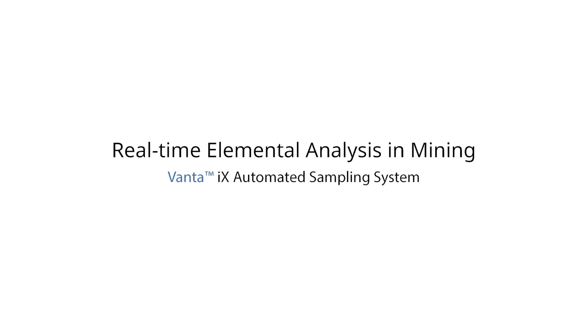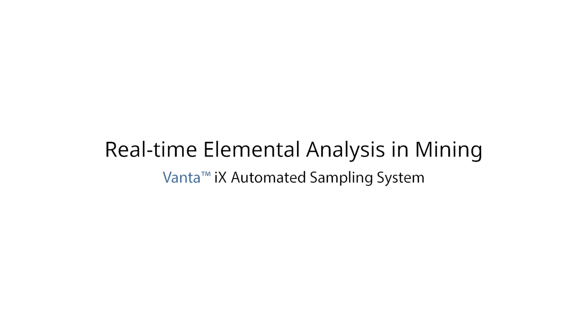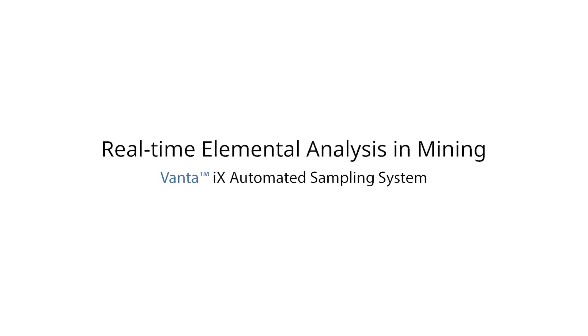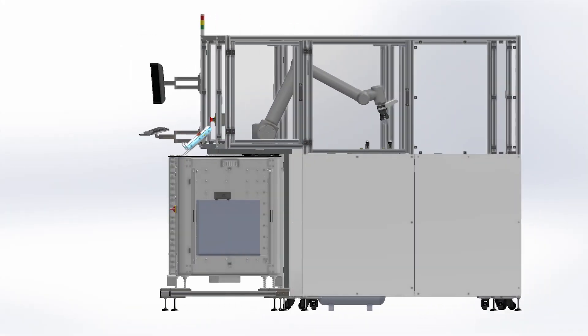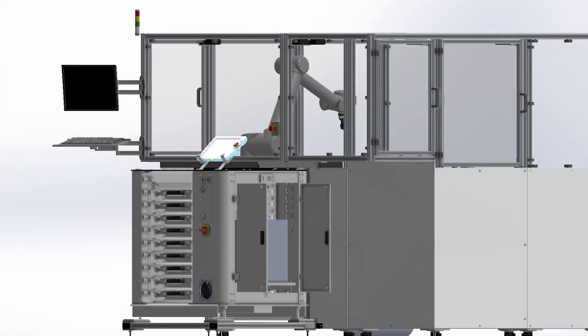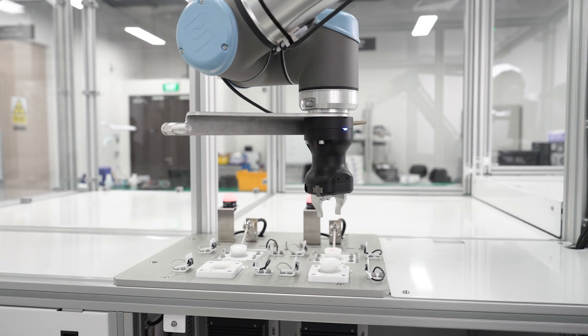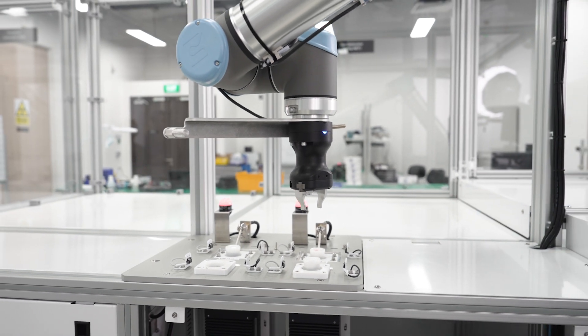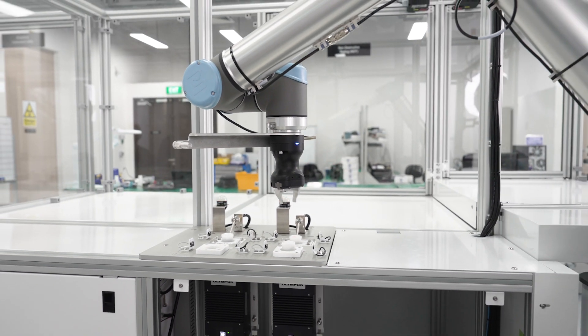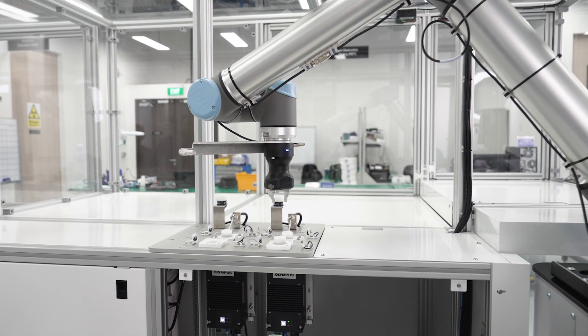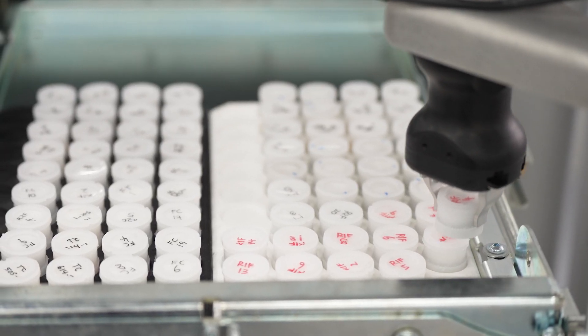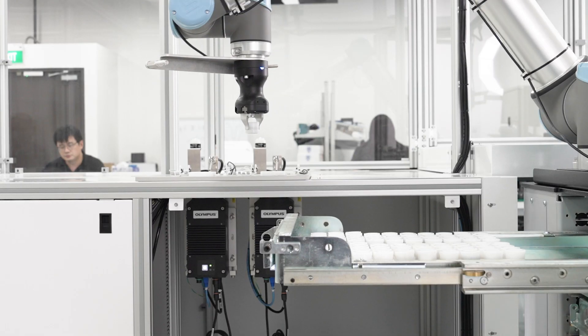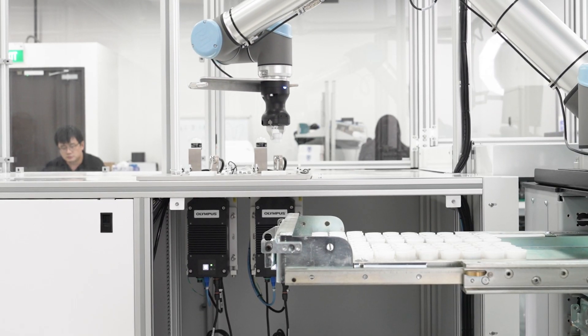That's why we created the Vanta IX automated sampling system. A custom-built solution designed to maximize the efficiency and reliability of elemental analysis in mining.